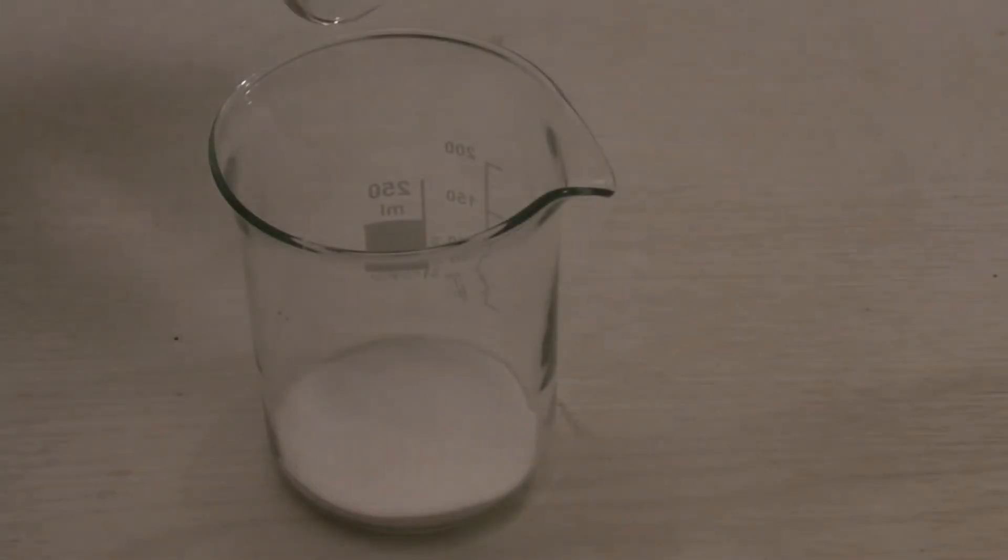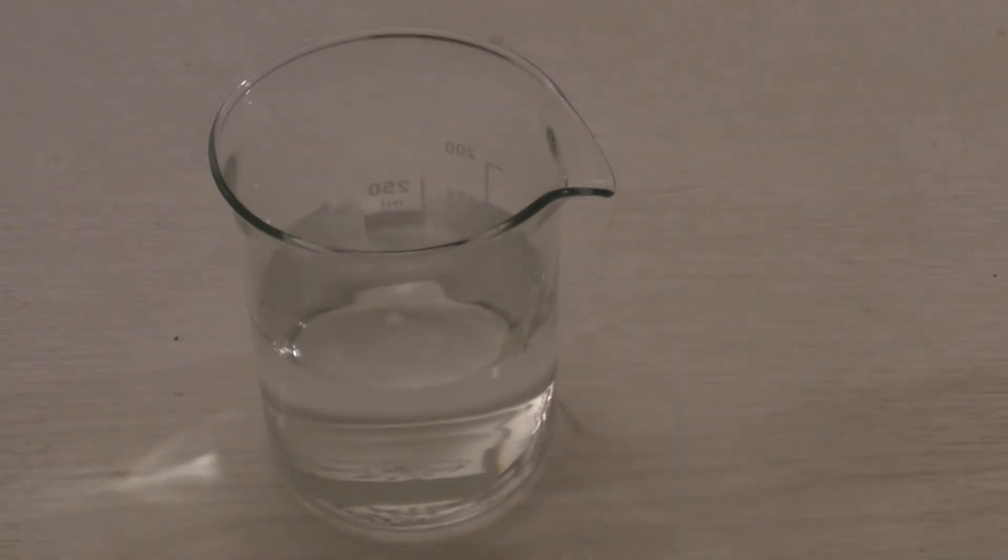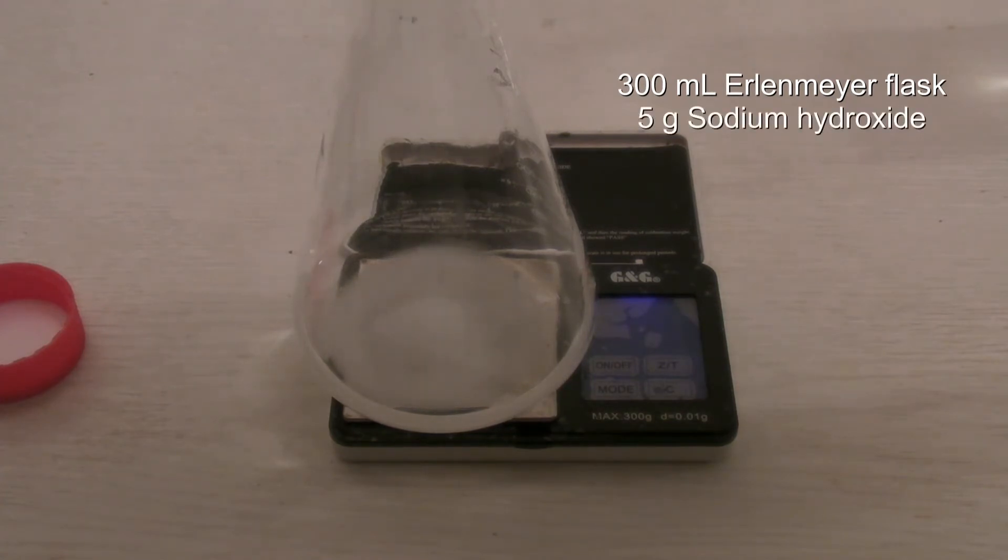In the 10 minutes when the sulfonation takes place, 7 grams of glucose were dissolved in 155 milliliters of distilled water. In addition to that, in a 300 milliliter Erlenmeyer flask, 5 grams of sodium hydroxide were dissolved in 50 milliliters of distilled water.